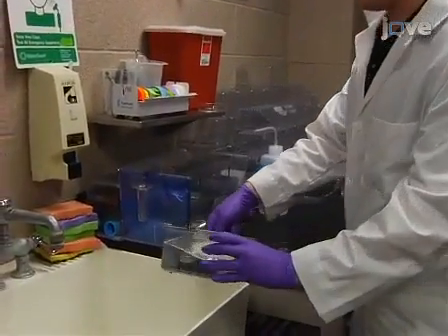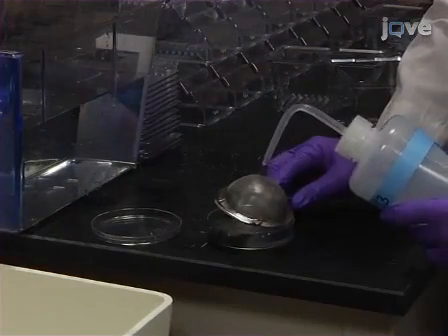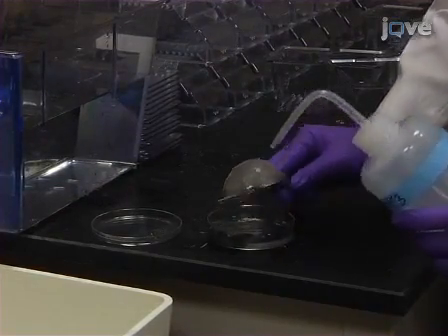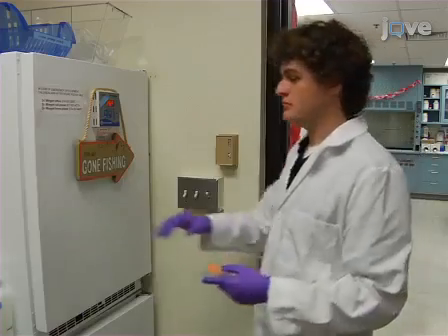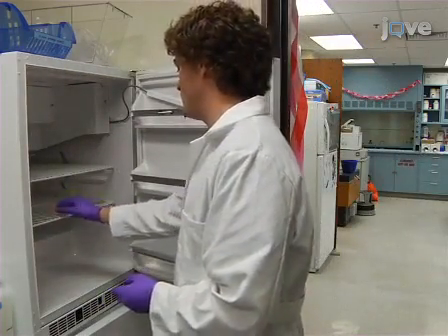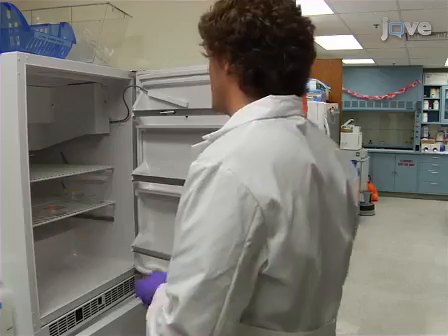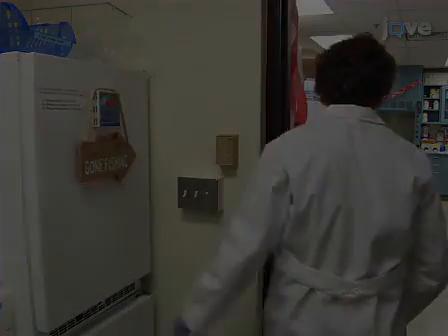In petri dishes, collect fertilized zebrafish embryos in modified E3 solution without methylene blue. Raise the fertilized embryos at 28.5 degrees Celsius until they are between 48 and 55 hours post-fertilization, when the embryo's renal system has begun to function.